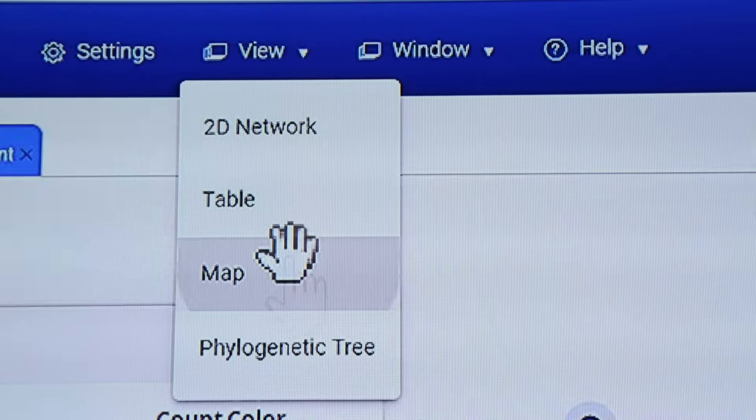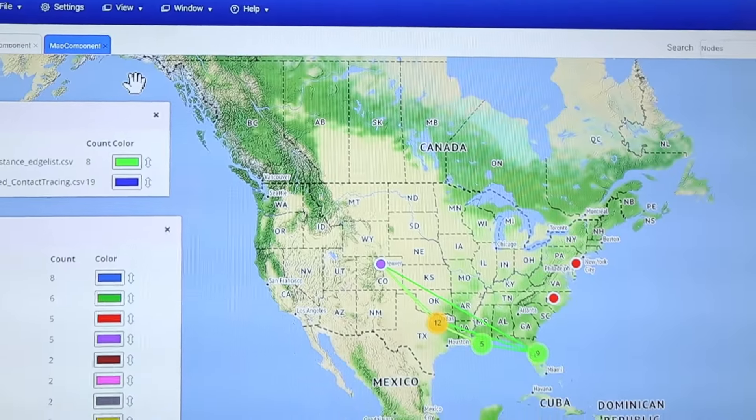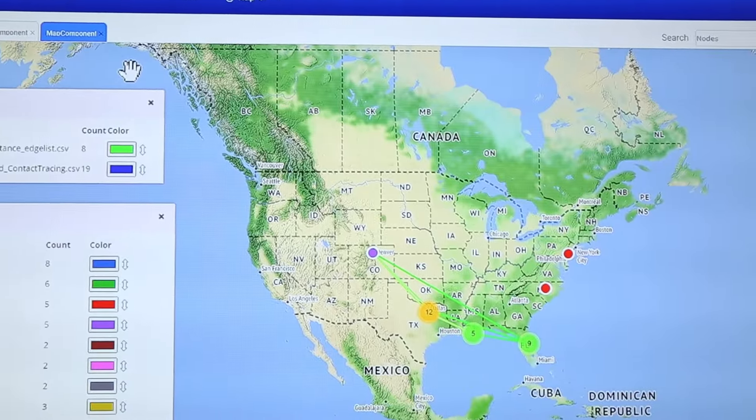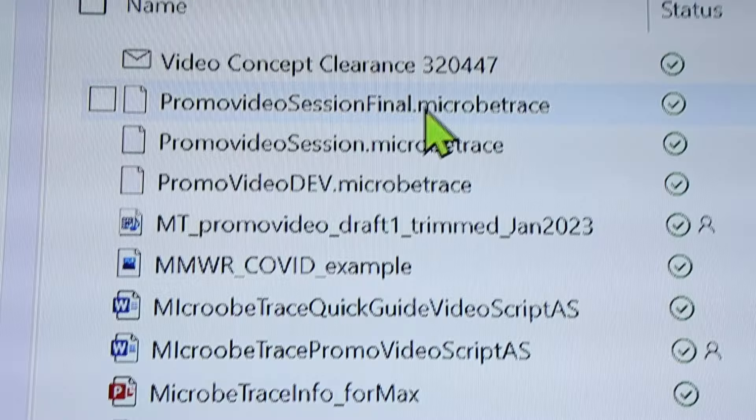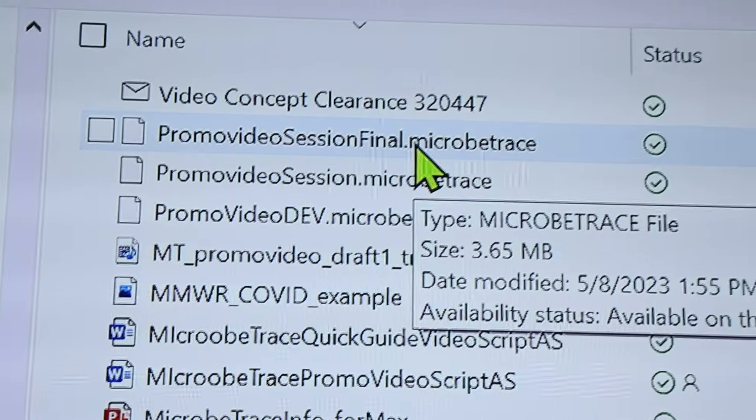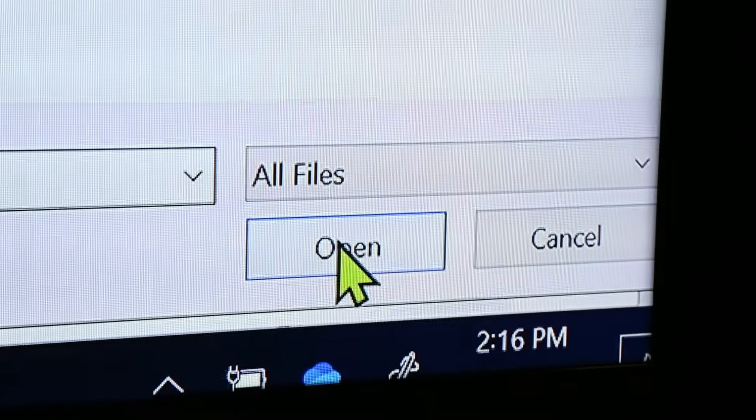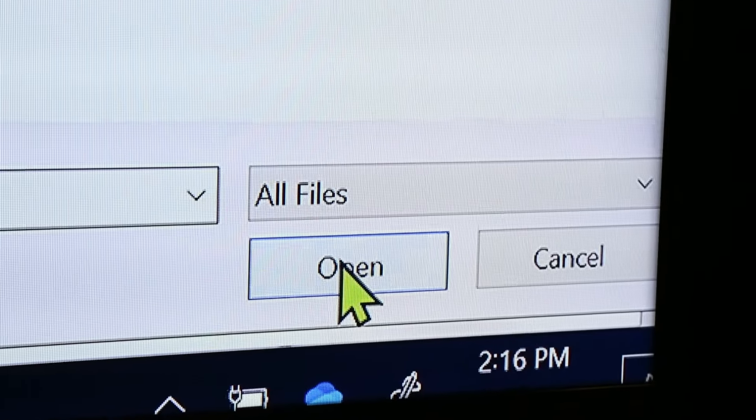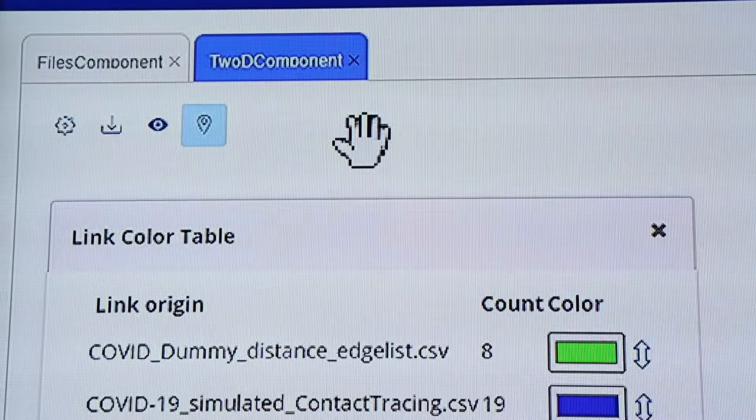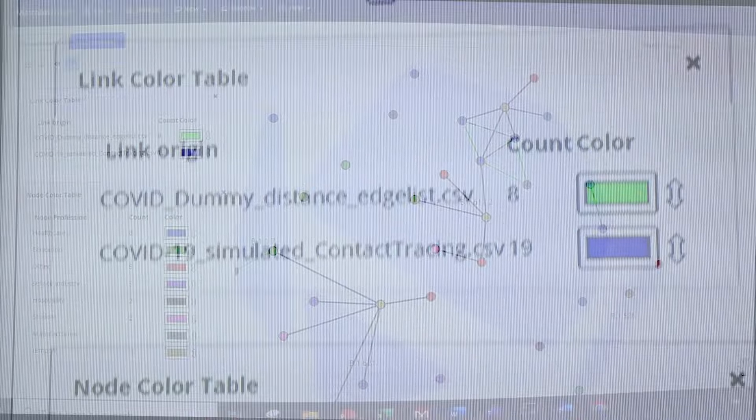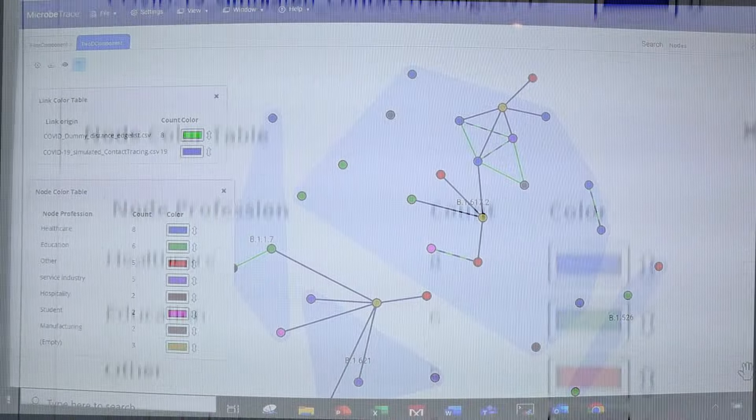MicrobeTrace is an intuitive, dynamic, and flexible tool to integrate epidemiological and genomic data as well as delivering vibrant visualizations.